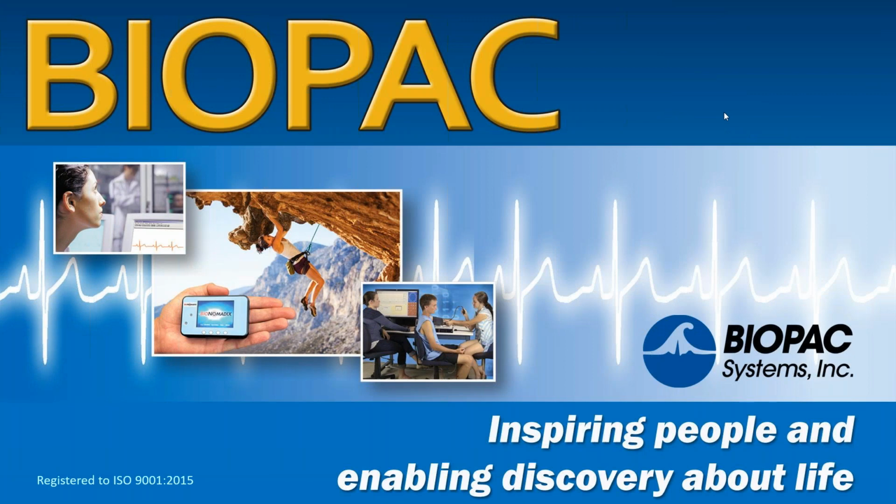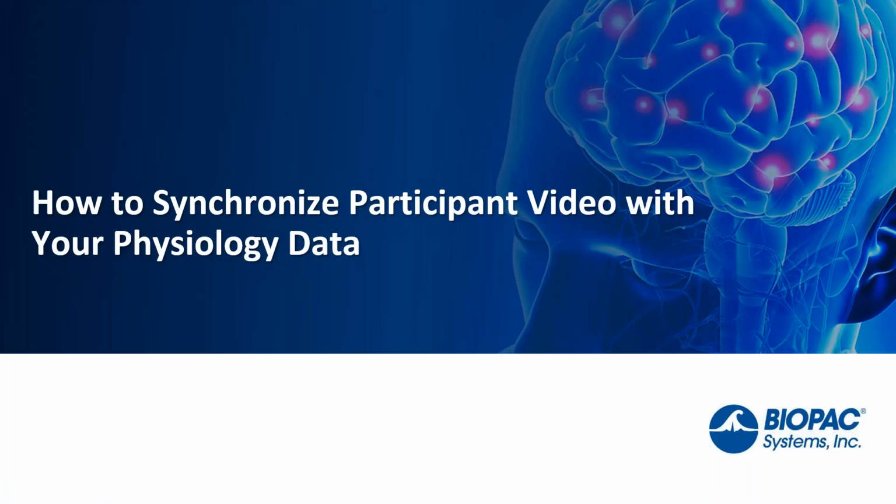I'm Brenda Dettinger from BIOPAC, and I will be your moderator on today's webinar, How to Synchronize Participant Video with Your Physiology Data. Today, we are exploring the hardware and software researchers use when they want to add video to experiments. There are a lot of benefits of adding video. We'll cover those in the next hour, plus we will explain how to set up the equipment and the software. We'll do a live demo of data collection with video.